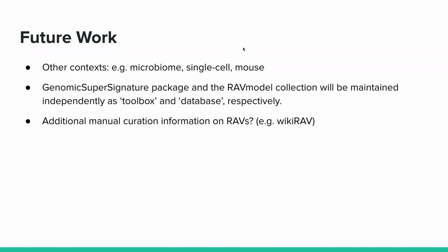And that's not the main problem. Your big problem with single cell, depending on how you process it, is that Rafa and Wolfgang and others have shown that your principal component number one is typically strongly correlated with the proportion of zeros in the data. So you're going to find that things line up, because that's related to the underlying level of expression. It might be useful to think more about what might be driving some of these principal components.